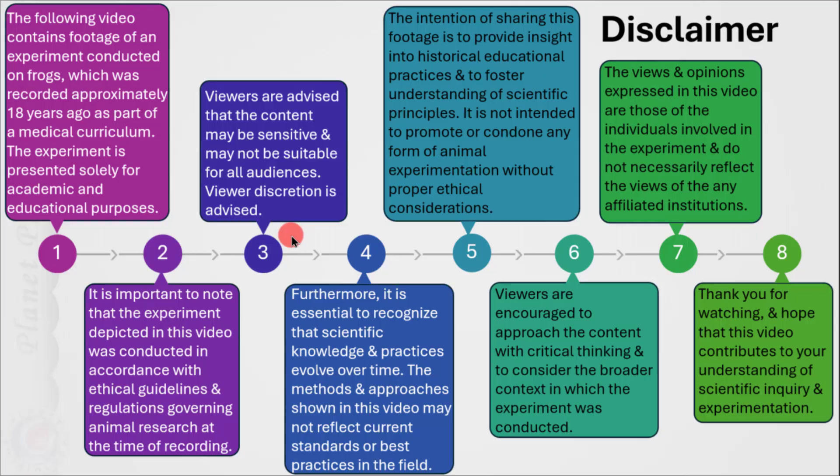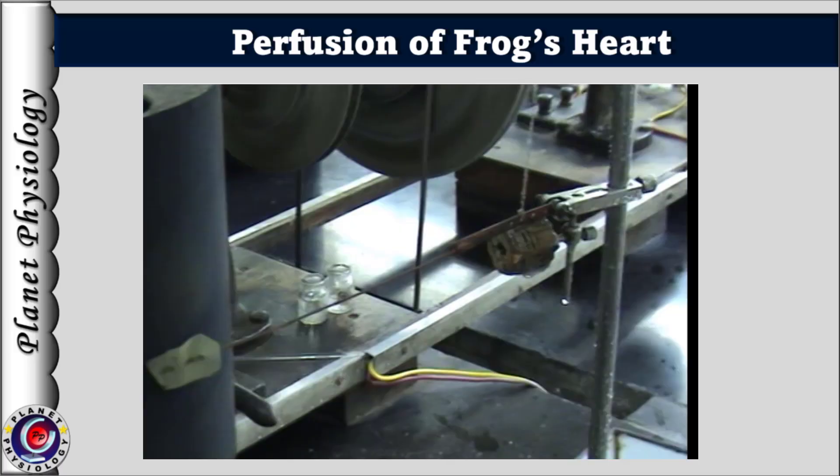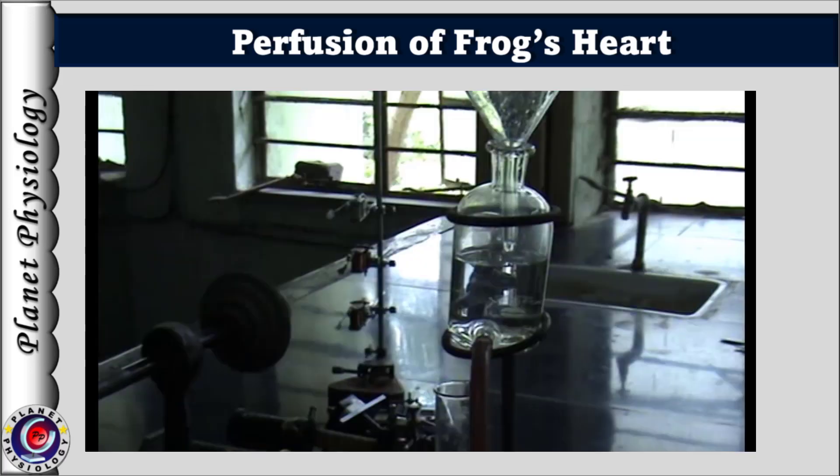Note that this experiment was recorded 18 years ago just for academic purposes. Coming to the procedure: on the stand, Starling's heart lever is fixed upside down with the spring facing downwards. Above the lever, an X-Block is fixed onto the stand to hold the SIMS cannula. The Marriott's bottle is placed on another stand and filled with Ringer's solution.